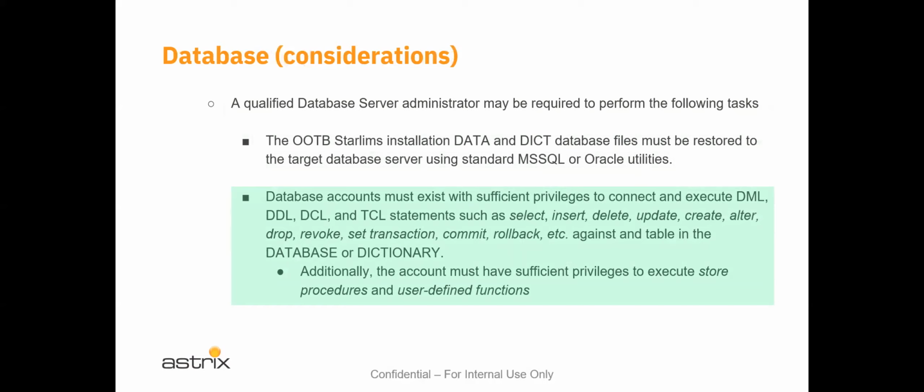It must be verified during the database installation that basic accounts exist with sufficient privileges that can connect and execute the DML, DDL, DCL, and TCL statements. That's kind of database mumbo jumbo for folks, for instructions that allow things like selecting data or inserting or deleting records, updating, creating functions or altering tables, anything like that. And that has to be available within both the database and the dictionary instances for the user that's logged in.